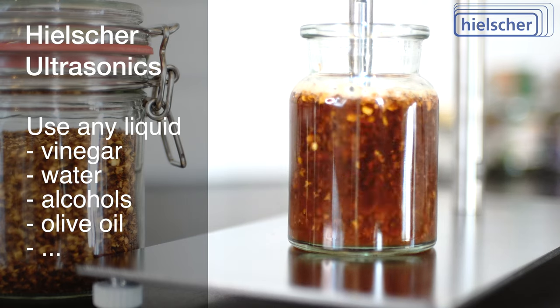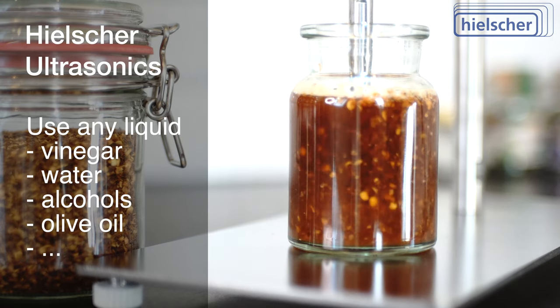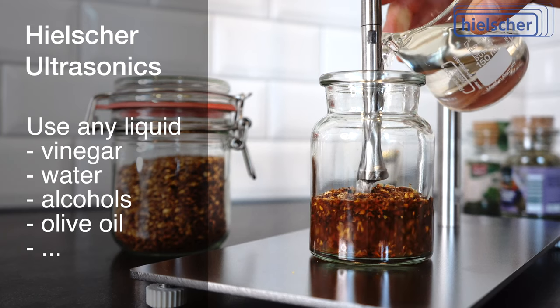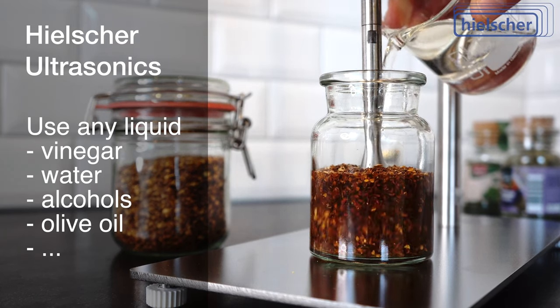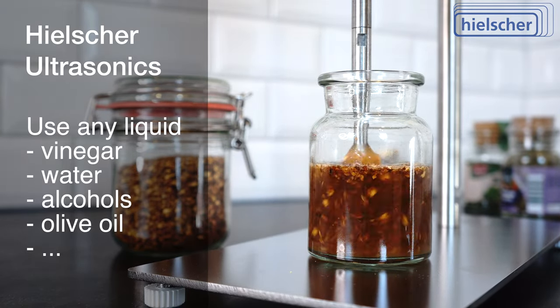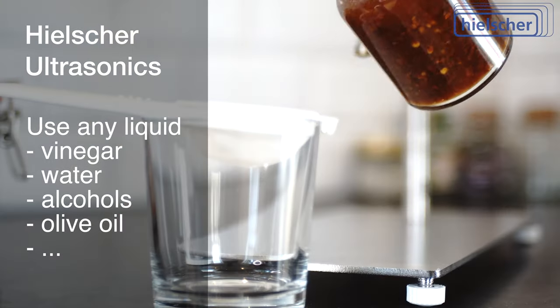You can use all liquids such as vinegar, water, alcohol, or olive oil as solvents. The handling remains unchanged — you add the liquid to the herbs and spices, then sonicate this mixture in a beaker or in a flow cell. Usually a few seconds are enough.